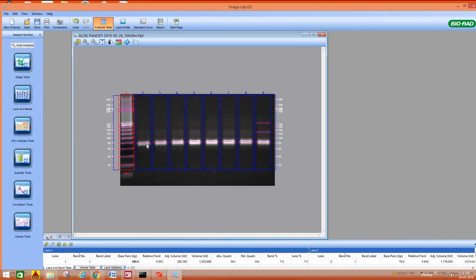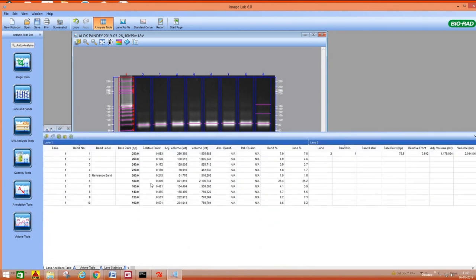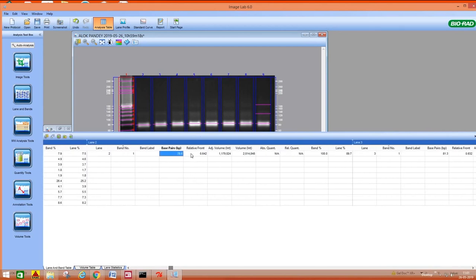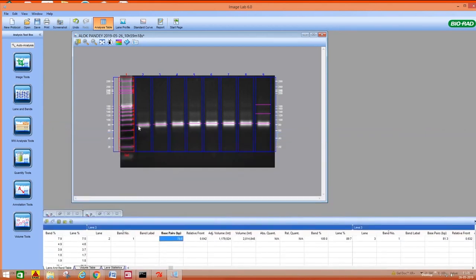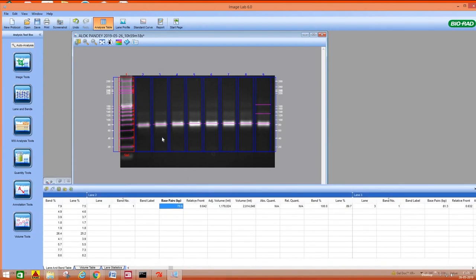So the next thing is, after being completed, you need not specifically look into what this band corresponds to. You just go to lane 2 values. This is lane 1, this is lane 2. Only a single band we are predicting, that belongs to 78.6 base pair value. This is in lane 2. As you can see, this is 80 and here it is coming, this is 78.6 base pairs. So in this way you can calculate the molecular weight of the nucleic acids also.